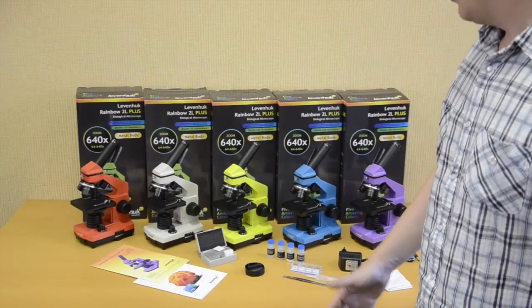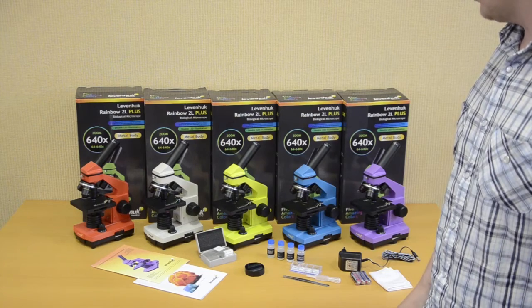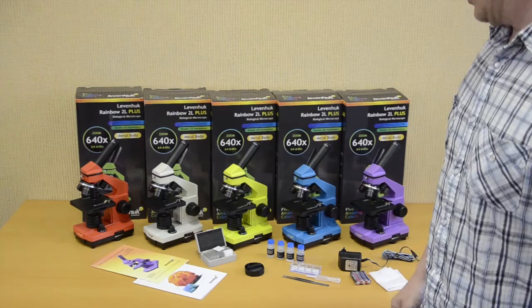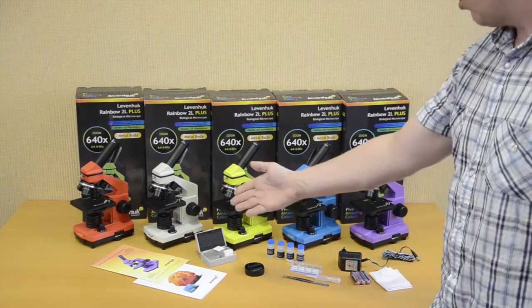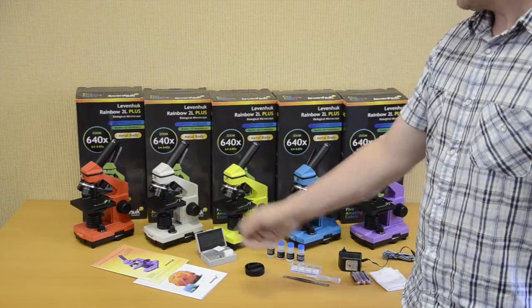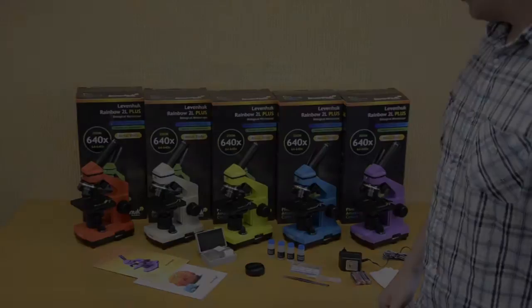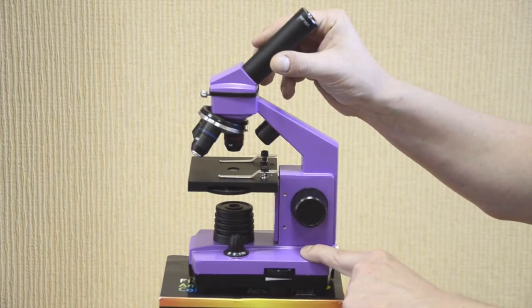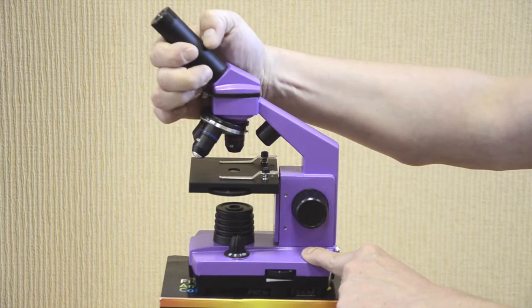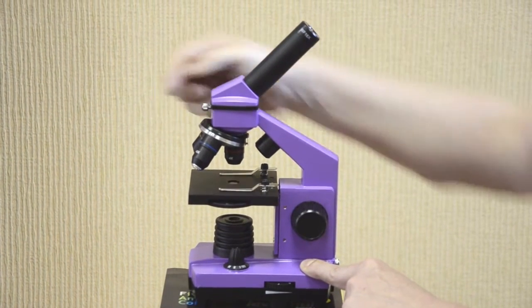Now it's time to present the Levenhuk Rainbow 2L Plus series of attractive color microscopes for children and students. The series color palette includes 5 colors. Each microscope is supplied with an experiment kit, prepared slides, and user manual, all packed in a wonderful bright gift box. The monocular head is inclined at 45 degrees, is 360 degrees rotatable, and has 2 working positions. It's locked with a screw.